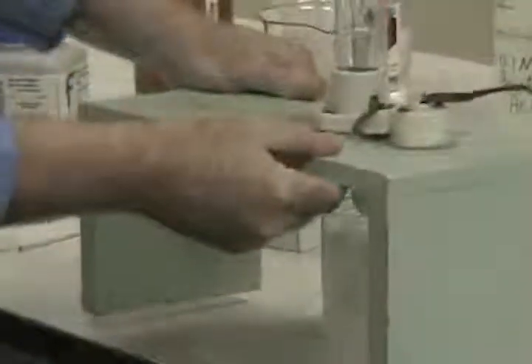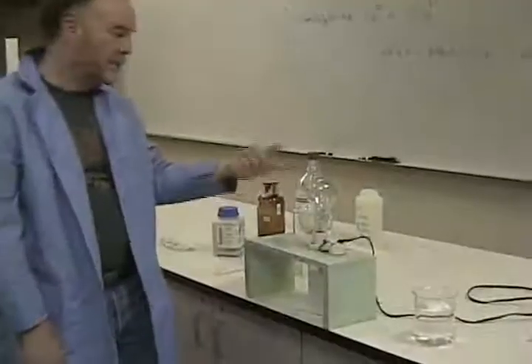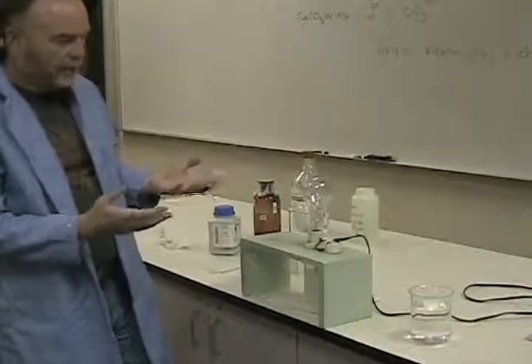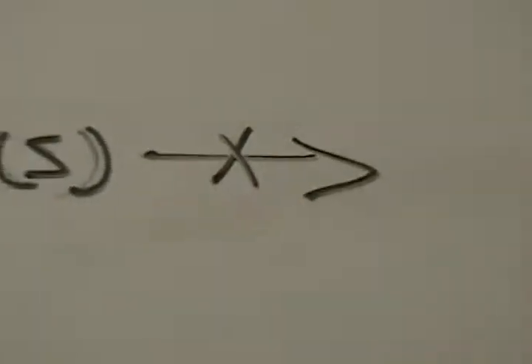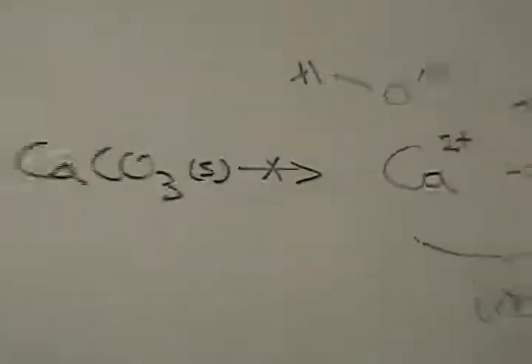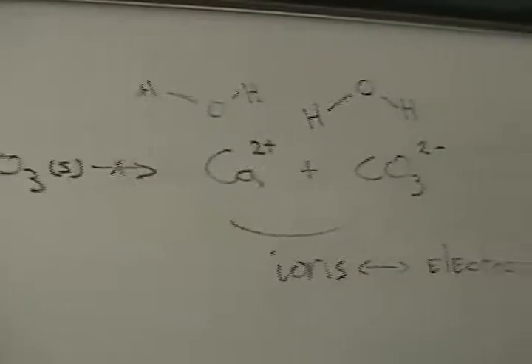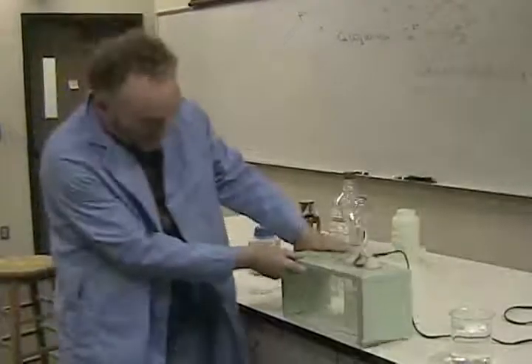And we'll test to see if it's ionized. We would see some kind of, turn the lights down here, we'd see some kind of glowing. And so calcium carbonate does not readily dissolve in water. Over longer times, some of the calcium and carbonate will appear in solution. And those are, of course, very common ions found in both surface water and groundwater.